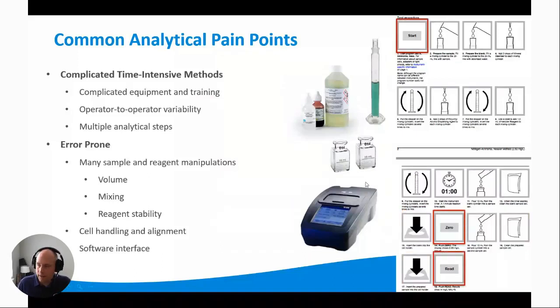So this spectrophotometer is measuring the absorbance value of a sample, but in order to convert that into a concentration, we need to compare the absorbance to a known standard, and that's a calibration curve that's built into most spectrophotometers. Well, all the Hach spectrophotometers, and this is an older model Hach spec here. But you have to choose the right method. You have to find it and load it, and there are multiple methods for multiple ranges, for multiple analytes, and it's not uncommon to get lost in the menu structure trying to find exactly the right method for the application.